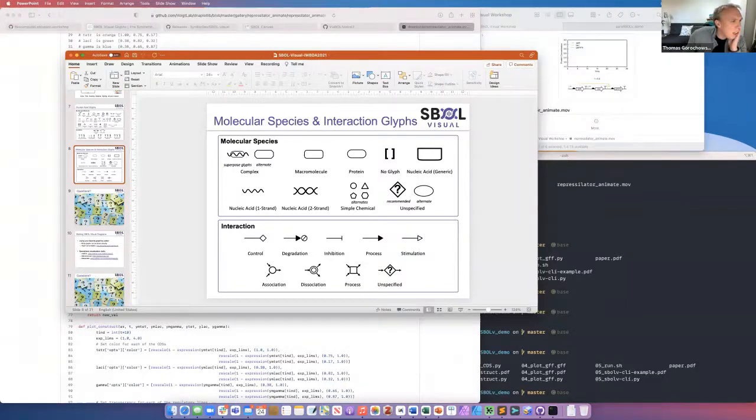Okay, so there's another one here. A few moments ago, we were discussing with James about including this SBOL2 construct visualization in one of our tools. We tried using it and it worked fine, but what was shown was the whole backbone along the page, not much visualization. Is it finished now?